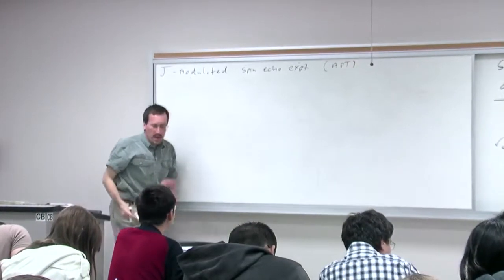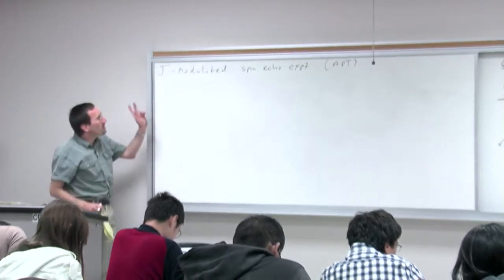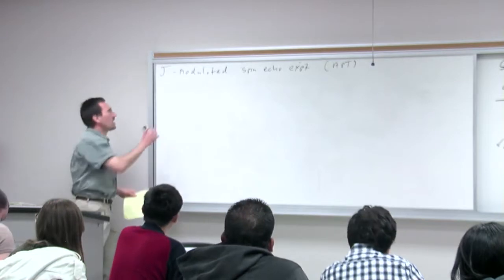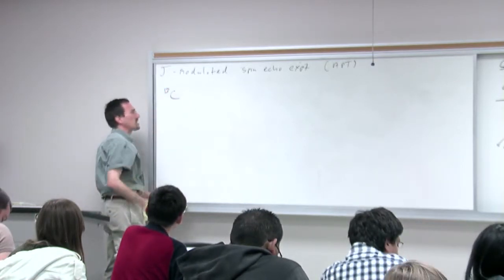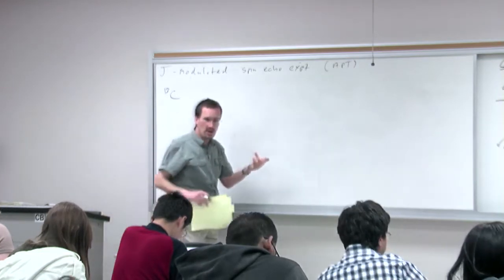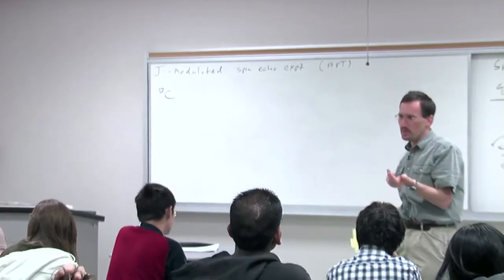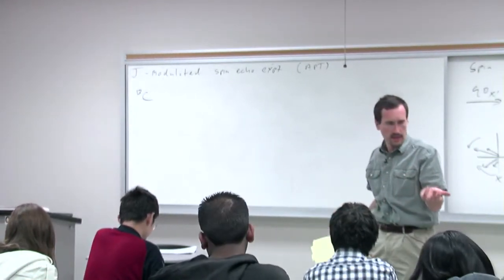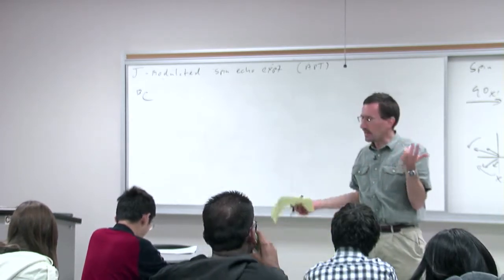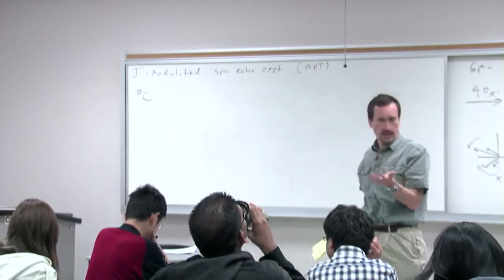All right, so now we're going to bring in the idea of two different channels. The experiment here is a carbon-detected experiment, and so we're going to be doing stuff in the carbon channel. Remember, normally when you're running a carbon-13 NMR, you're proton decoupling. The reason is, remember all those coupling constants I talked about, the 1J CH being like 125 hertz, and the 2J CH being like 10 hertz.